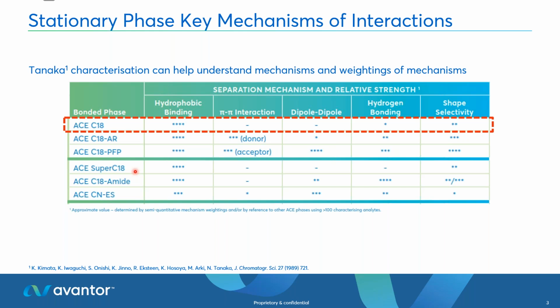So that could be another dimension when you're doing your method development, if you've only got that 2-column switcher to play with pH, because again, we've seen massive differences in selectivity when you're analysing ionizable compounds, of course, by changing the pH between high and intermediate or high and low pH.